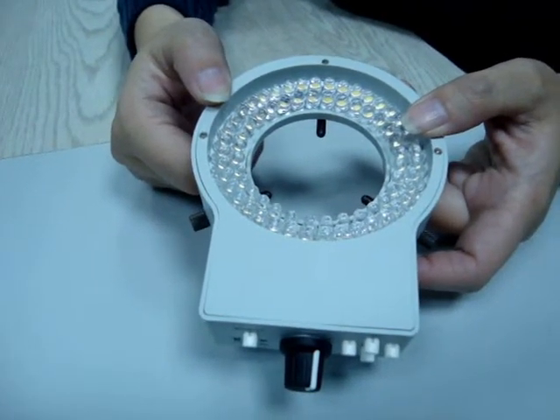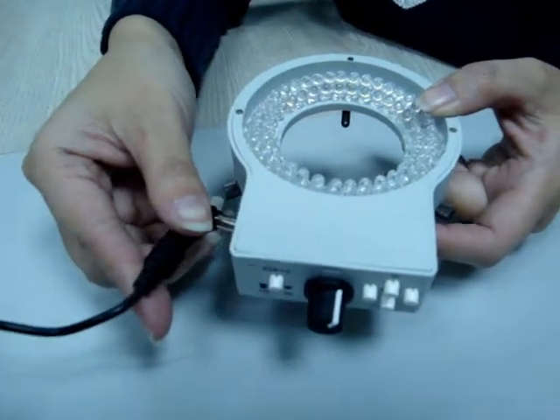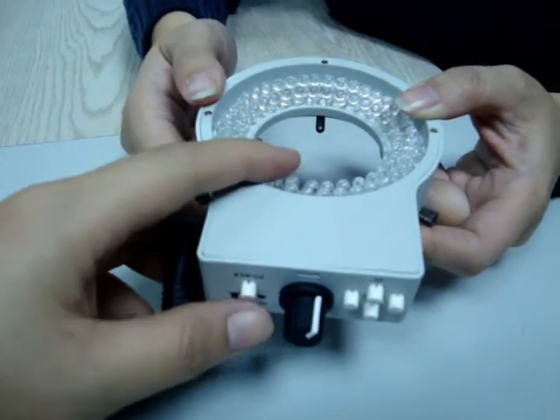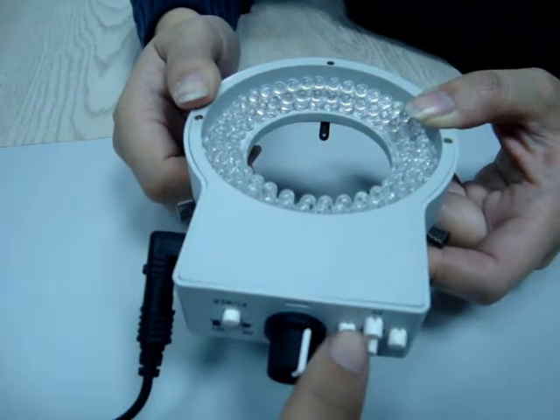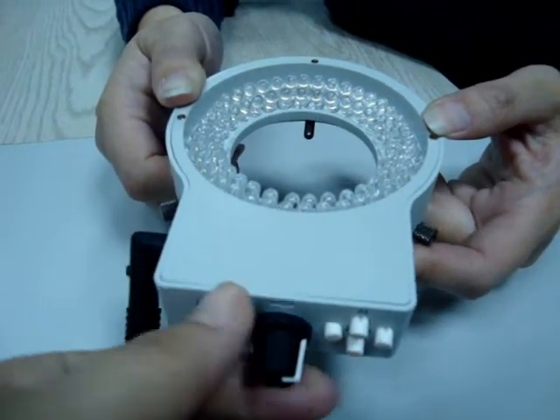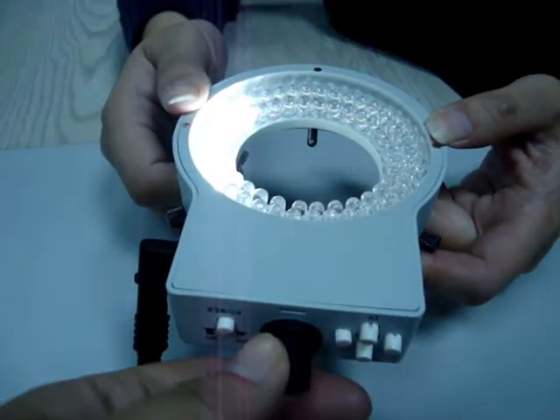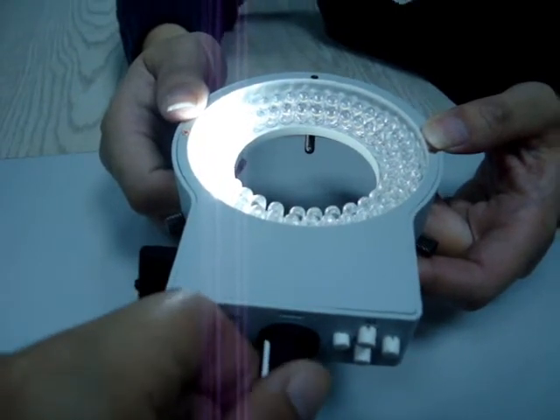When you get this product, all you have to do is just plug in the adapter, press the button, and see which area you want it to light up. We will try this one first. You can adjust the intensity to the brightest or make it lower.